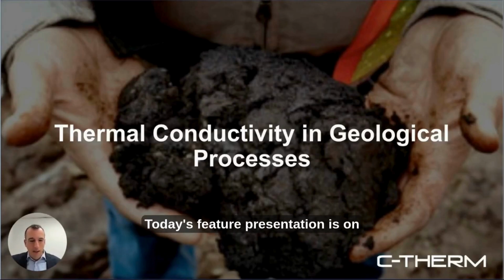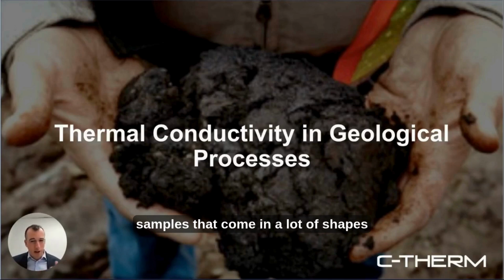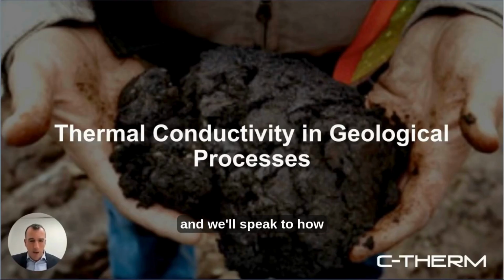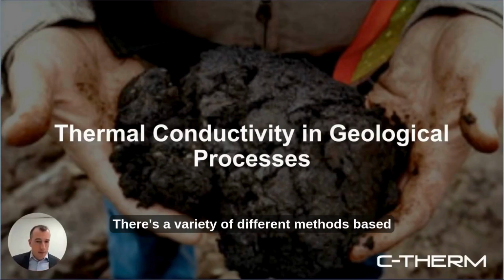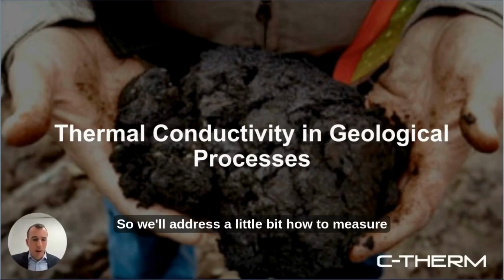So today's feature presentation is on testing the conductivity of different types of geological samples that come in a lot of shapes and formats and states. And we'll speak to how to characterize them. There's a variety of different methods based on what type of sample you're dealing with in geological terms. So we'll address a little bit how to measure it.